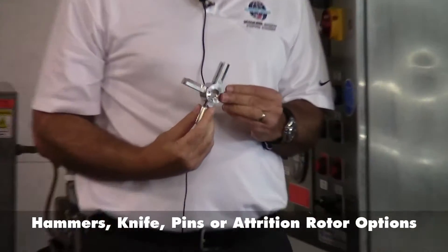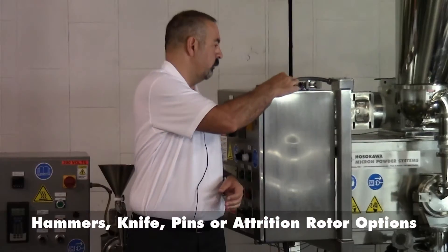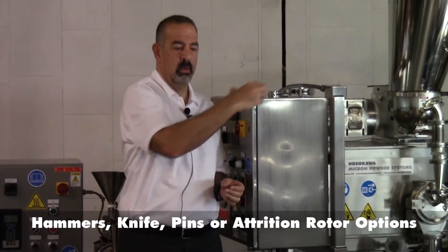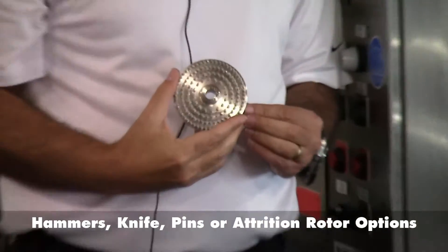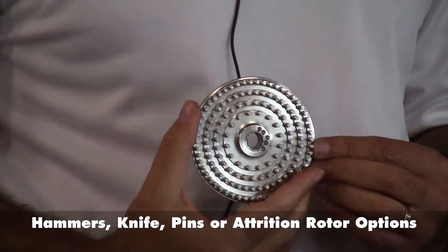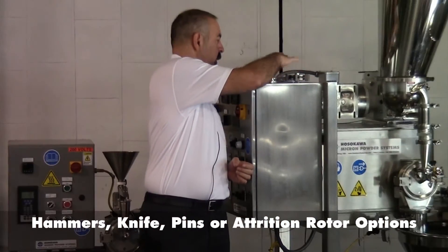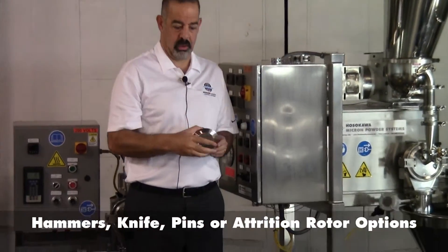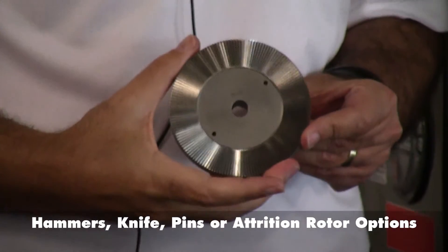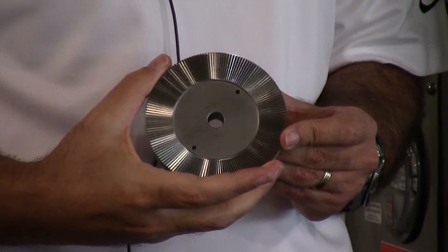A rigid knife rotor for coarse grinds and de-agglomeration. Our pin rotor setup for fine grinds and where you want to eliminate potentially plugging of screens due to waxy or oily material. And newly developed, our AFS rotor for attrition style milling for fibrous or polymeric materials.